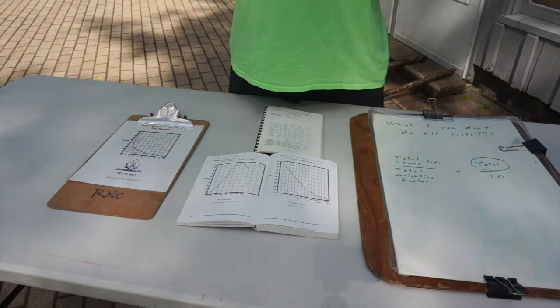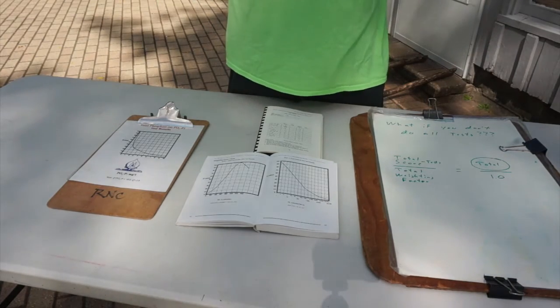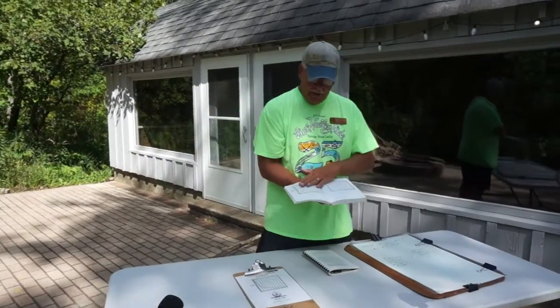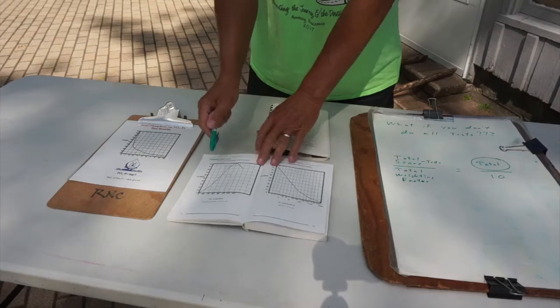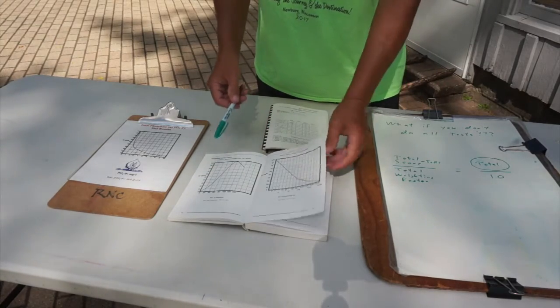Okay, so now the last thing that we're going to do, we're assuming to start with here, we've done all 9 tests. So here are our 9 tests. We have a chart that we're recording all of our data into. We got that data by going through our Q values and connecting our Q values.